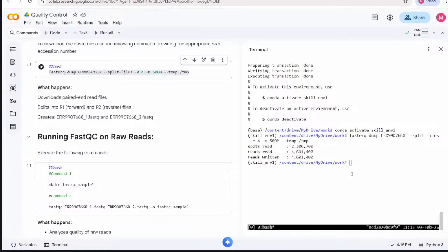And the thing is the threads. Threads are basically the cores of your computer. When we run a command, it occupies a particular node. Suppose you have a 16 core or 32 core system. It's basically a hardware and software thing for computation.